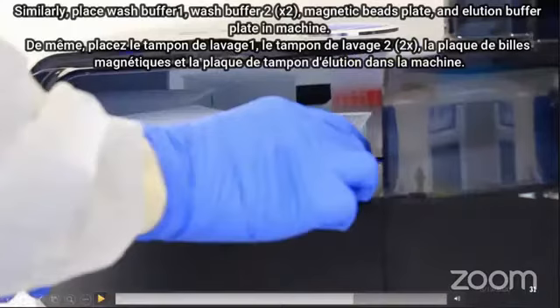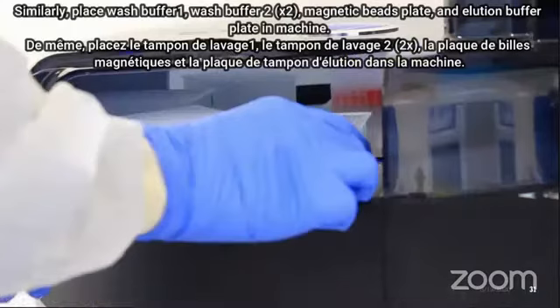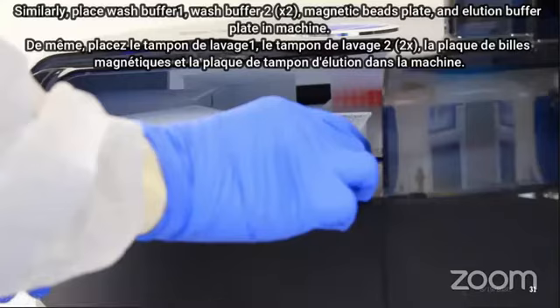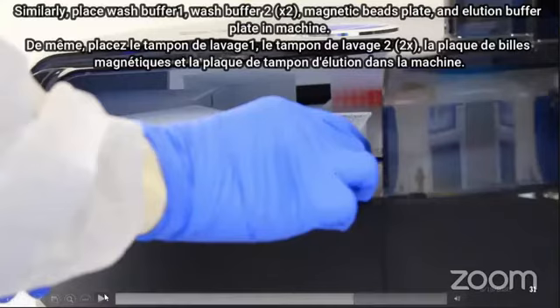while placing into the autoplate to the plate holder, make sure that the missing corner of the base faces towards the lower left. On the deep well plate, there is a missing corner, and this missing corner should be fixed on the template present on the machine.